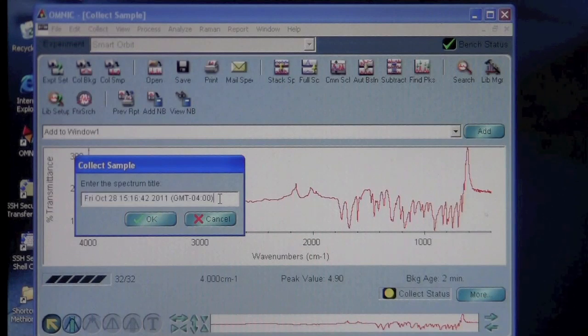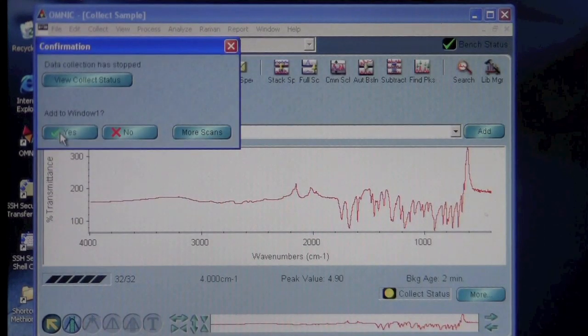Here it comes. If you wanted to change the title, you could change the title here. Then you could click OK and it will add it to the window.